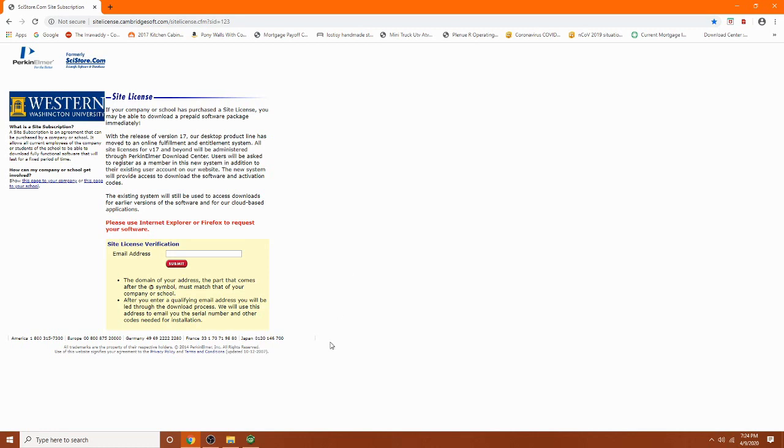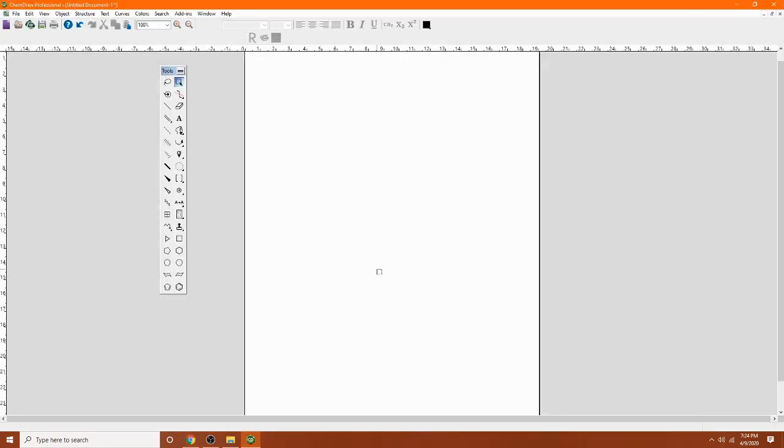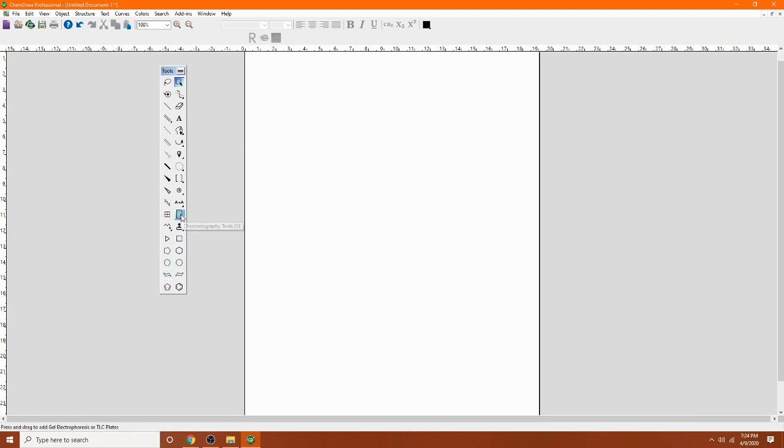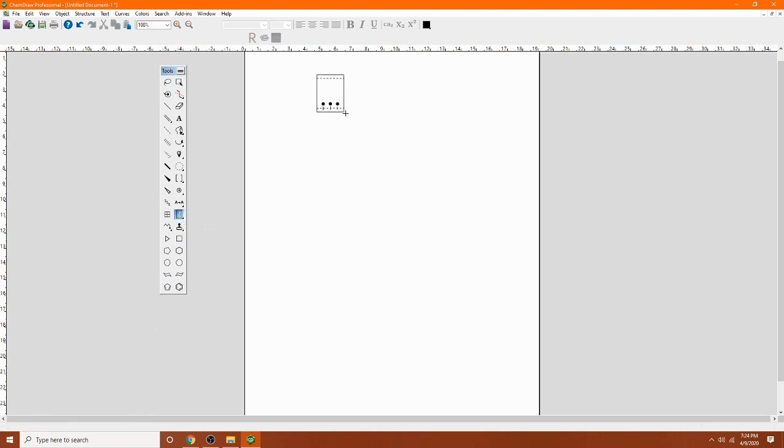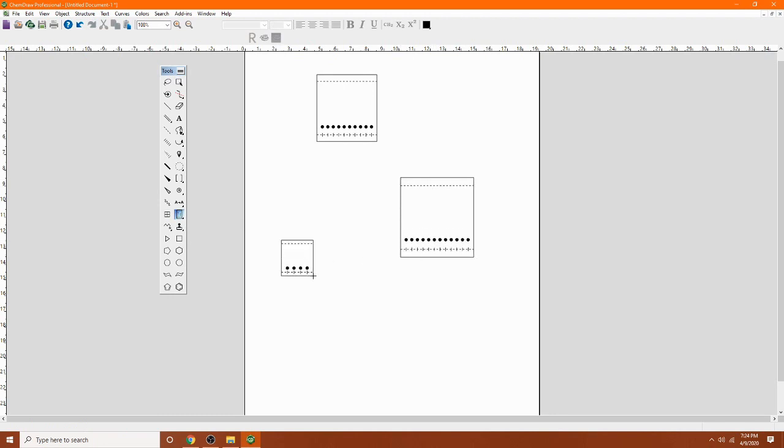So once you have it installed, open up the software and this is what it looks like. On the left side, you will find the toolbar. On the toolbar, you will see a little chromatogram. Click on that chromatogram and click and drag on the white template here. Click and drag. So you have a TLC plate with multiple lanes.